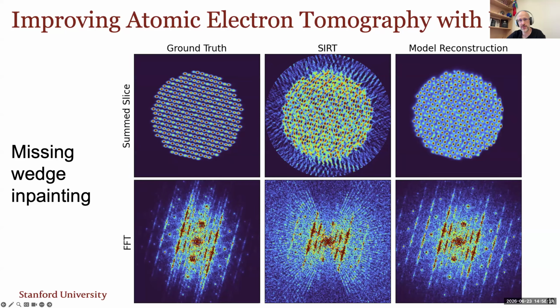And if it's not a beam-sensitive material, you keep it at higher dose, like several thousand or tens of thousands of electrons per diffraction pattern. So the last bit here, the limitations towards fast 4D-STEM acquisition, I just don't think it exists anymore.